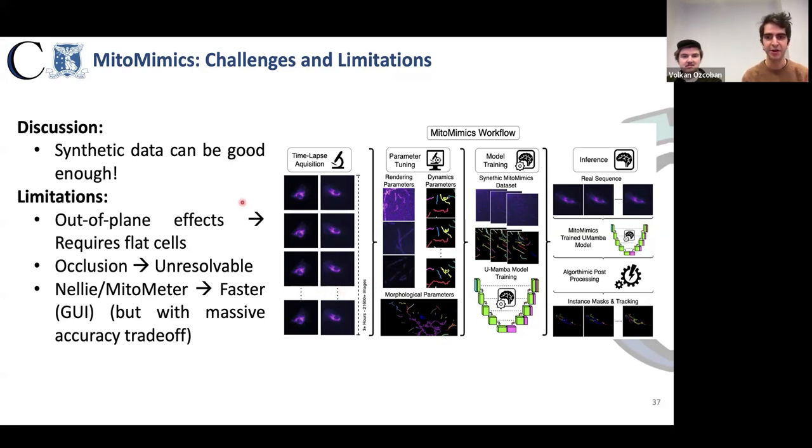In terms of limitations, overlapping mitochondria in 2D imaging can occasionally be misclassified as fusion and subsequent fission events. However, this is largely an inherent limitation of 2D analysis rather than the pipeline itself, and is actually shared by all the other existing segmentation methods, regardless of what you do. While we could go to 3D time-lapse imaging, and that could address the issue, it introduces additional technical and experimental challenges.